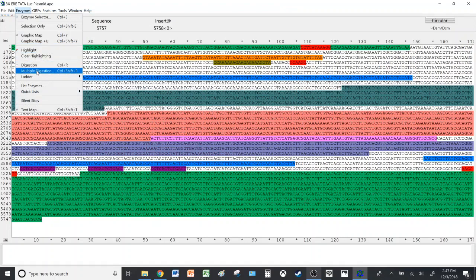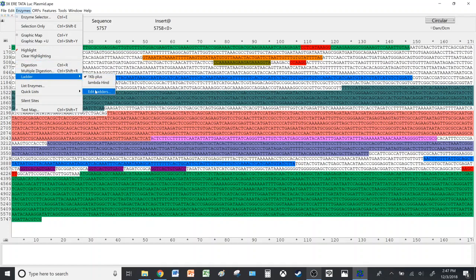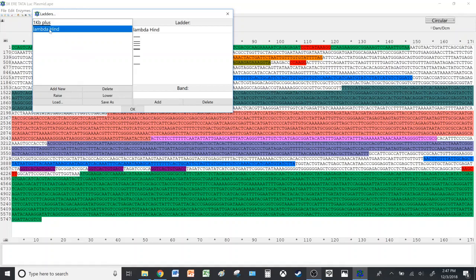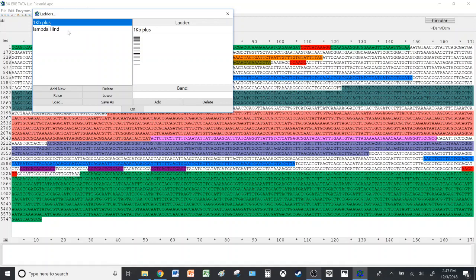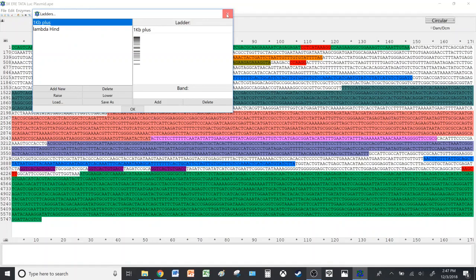Close this, then we'll go to Digestion. You have Digestion and Multiple Digestion, but before we look at those two, let's take a look at the Ladder. You can edit the ladders that have been preloaded with the software, but for this demonstration we'll just choose the 1 KB Plus. It also shows you the shape of the ladder as well as the sizes of the DNA.